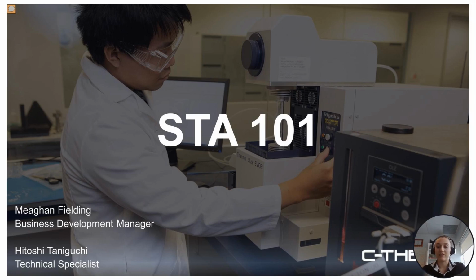So today in STA 101, you can expect to learn some principles of STA, how to analyze STA curves, how to optimize measurement conditions, and some of the advantages of the Rigaku STA system.